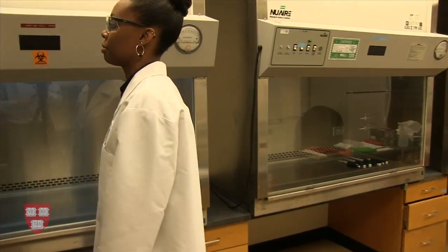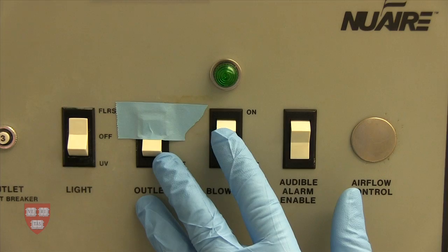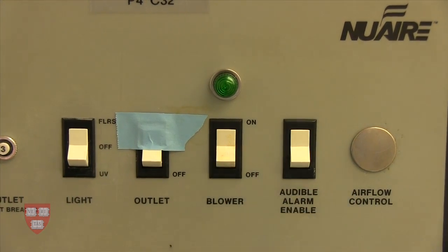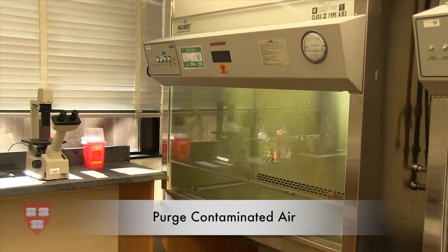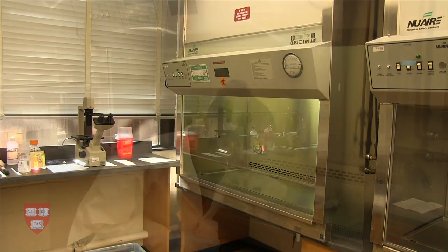To prepare the BSC, toggle the UV light switch from UV to visible light. Turn on the blower and turn on the airflow alarm. Allow the blower to run for a minimum of 5 minutes. This is an important step to purge contaminated air that might settle while the cabinet is not running.